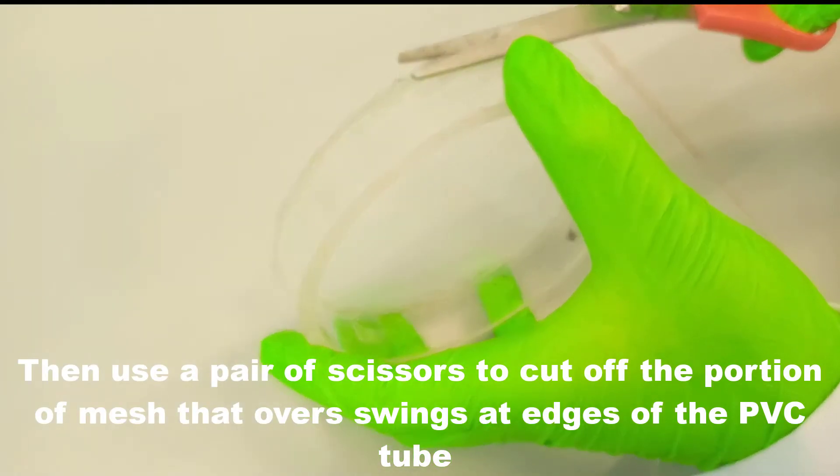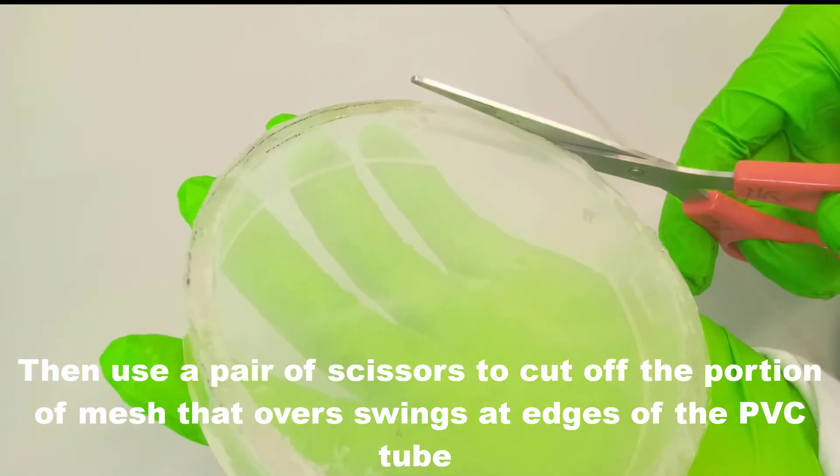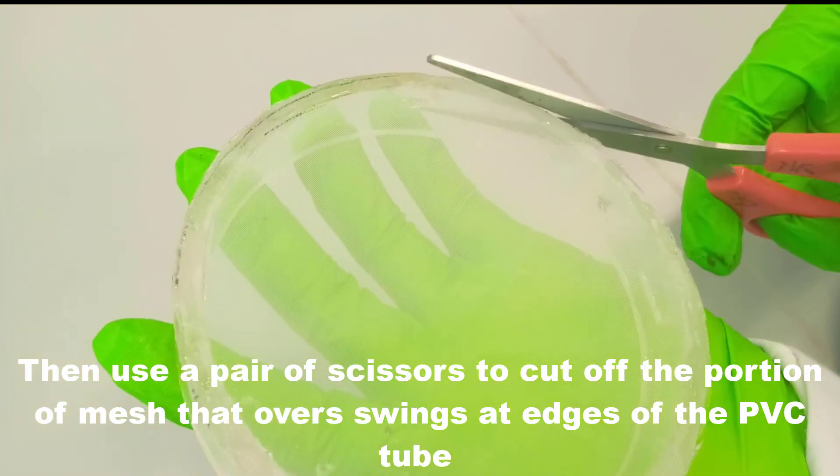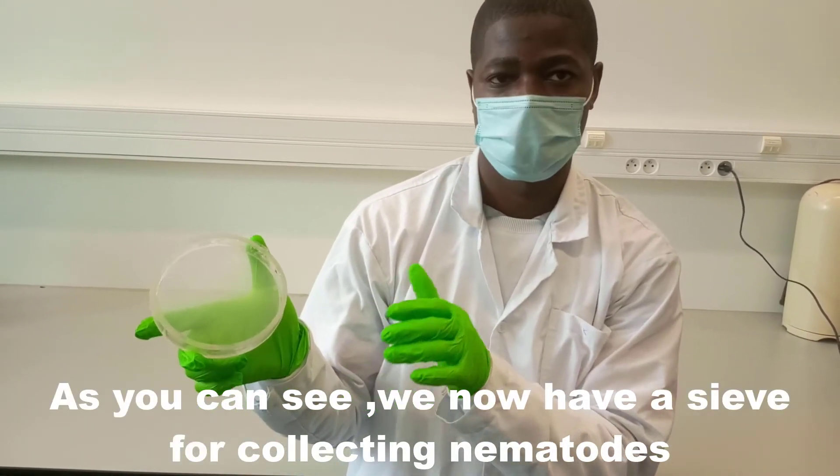Then use a pair of scissors to cut off the portion of the mesh that overhangs at the edges of the PVC tube. As you can see, we now have a sieve for collecting nematodes.